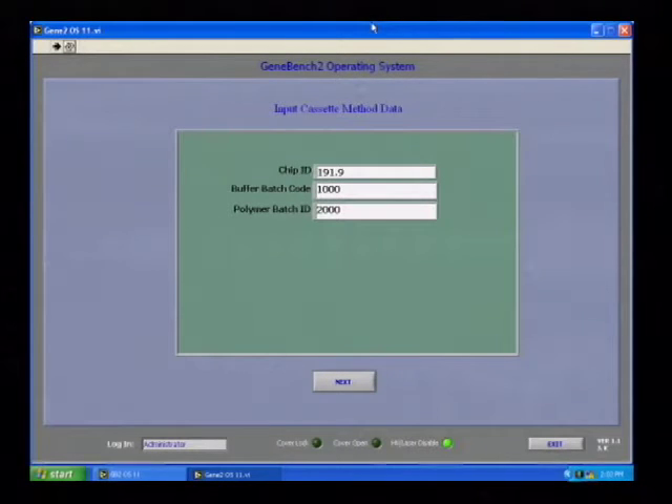The next thing a user is required to enter is the chip ID — identifying the chip with samples loaded into the chamber — along with the buffer batch code and the polymer batch ID. This provides a way of tracking all parameters related to a specific chip and the samples loaded on it.